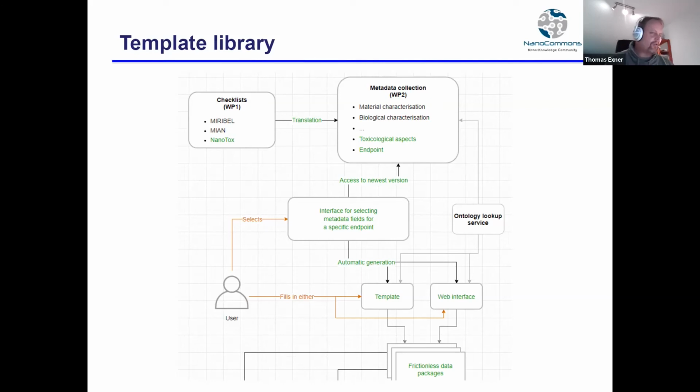And I hope that we can at least start with this kind of thinking, very, very specifically, what data is needed to report. Yeah, and then when somebody starts with this kind of an instance map, and they say, okay, I want now to make this kind of experiment, then you would get already these data templates, specifically for an experiment. Yeah, it's a lot of work, I know, but I think by the separation in smaller things, there can also be a lot reused.